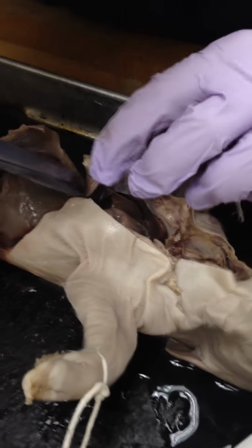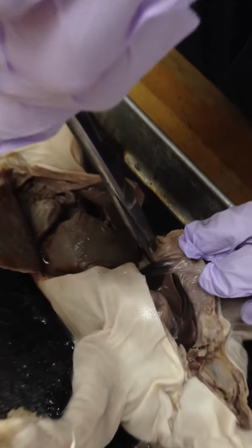Okay, so this is all the diaphragm. I'm slicing up some more. I thought there were better pictures.